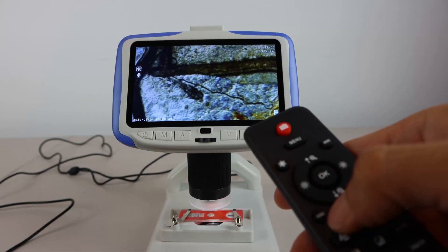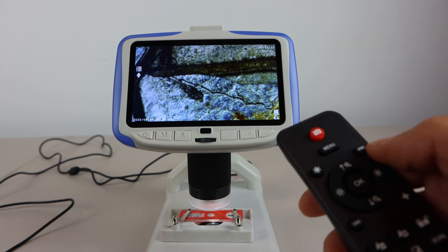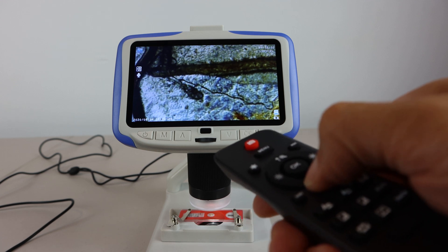To avoid causing vibrations when touching the screen, you can use the remote control to zoom in and out instead.